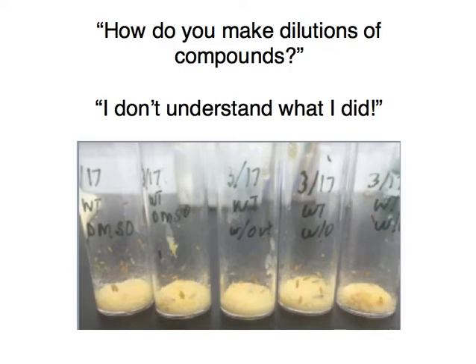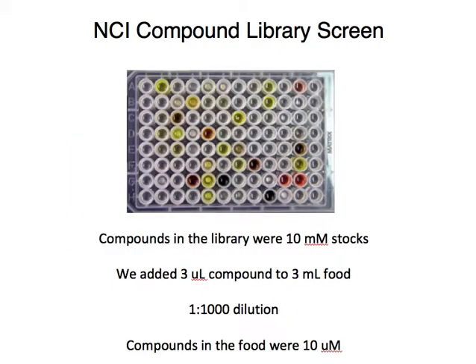In this tutorial, we're going to cover dilutions. Specifically, we're going to talk about dilutions relevant to the experiment you've been performing in the Discovery Lab. A lot of people are unclear about how the dilutions came to be, so we'll walk through some examples, starting with where the compounds came from.